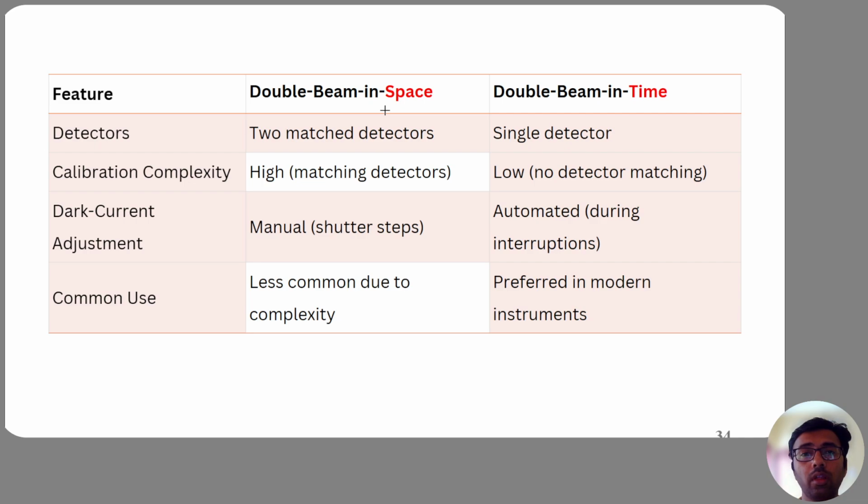Now we shift focus completely from hardware to chemistry inside the cuvette.